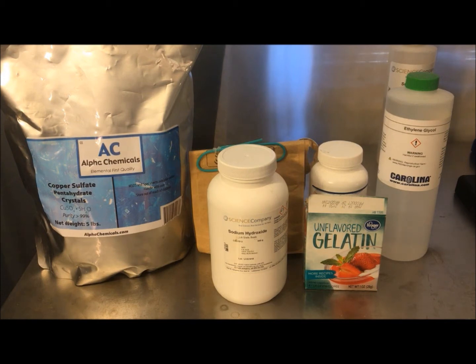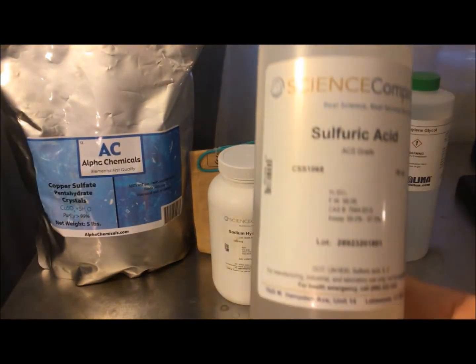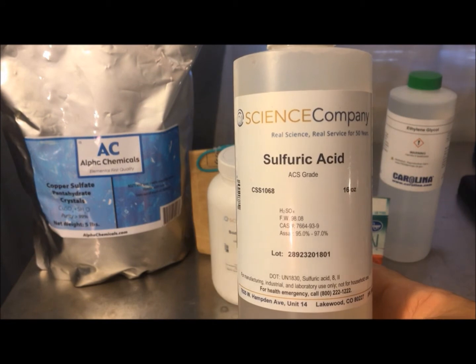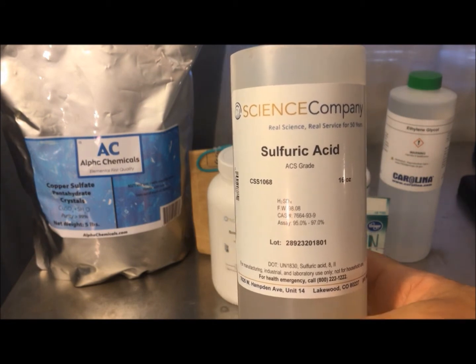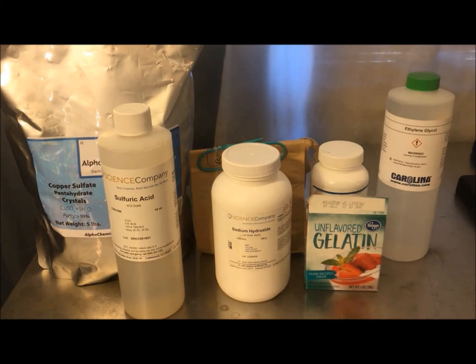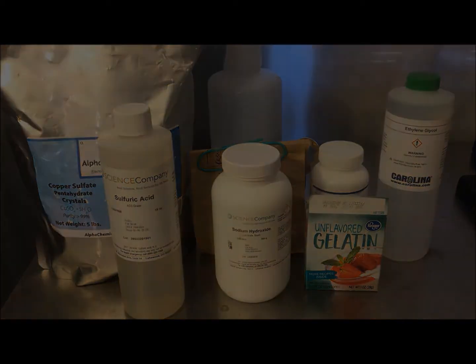You can also use it to control the pH of the reaction solution along with sulfuric acid. Some of the studies suggest a neutral pH around 7 makes the smallest particles. And then of course today we're going to just use the distilled water as the solvent. And that's it as far as reagents.